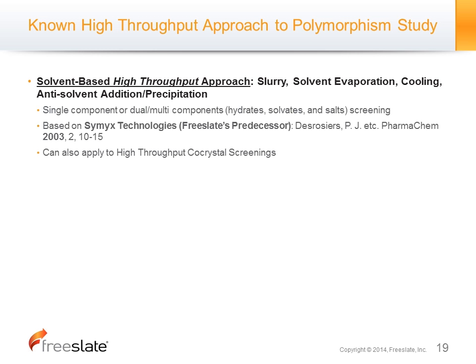Let's look around for a high throughput approach. What I mean by high throughput approach here, I'm going to elaborate a little bit more, is that from the initial experiment all the way to analytical, there's no bottleneck. With certain techniques, you might have a quick way to do something in part of the process, but if you have to do the analytical individually, there's a bottleneck, and then it's not truly identified as a high throughput approach.